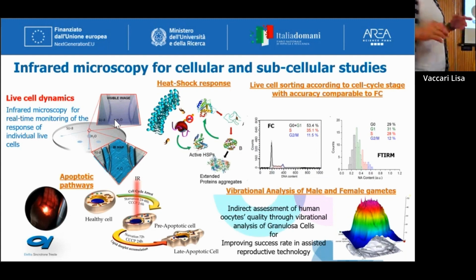So you have for example, in this study here, it is a thermal treatment. When you reach 42 degrees, your proteins are completely misfolded first and then packed in very large aggregates. So you lose all the bioinformation. But it seems that UV treatment seems to be very promising. So first thing is to find a way to inactivate cells without perturbing too much the biological profile, because this will help you to study them still alive, still hydrated at least, in order to get more similar results with other techniques.